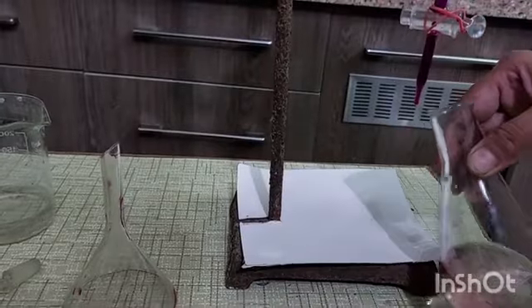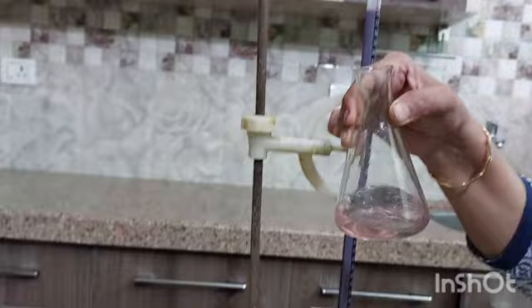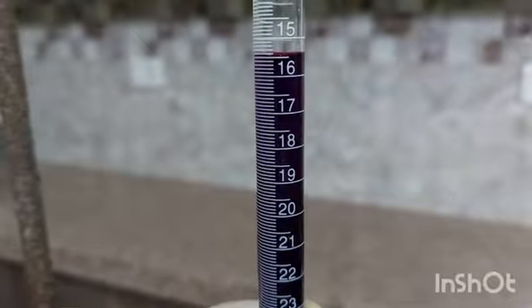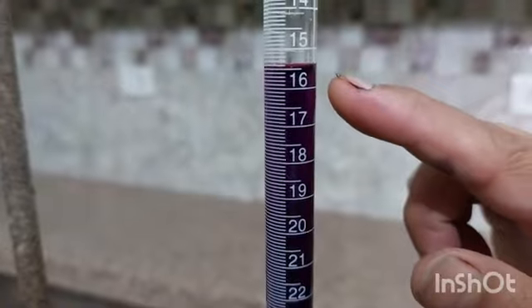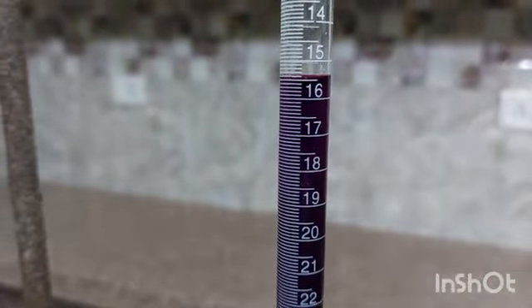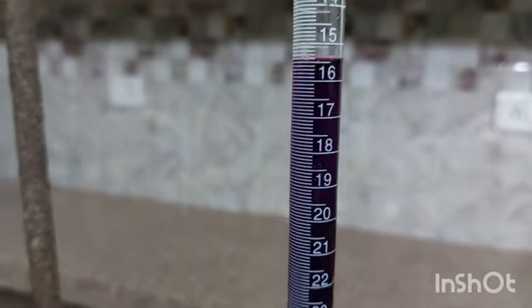Now this transparent color has changed into pink color. This is the end point of this titration. Note the reading. This is 15.7. Repeat the procedure at least 2 times more until you get matching readings.